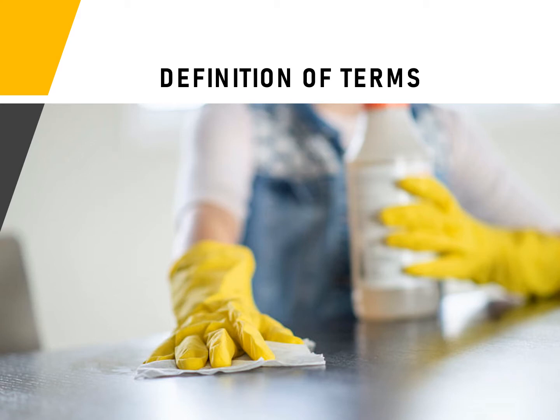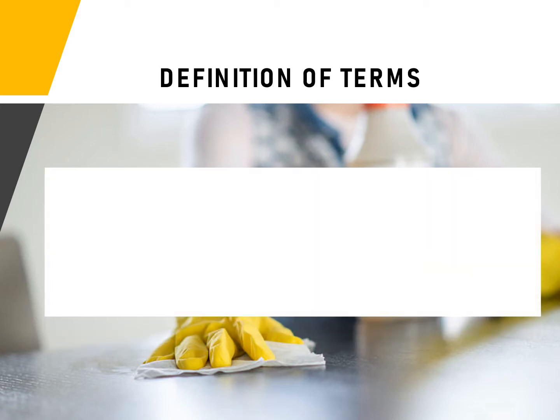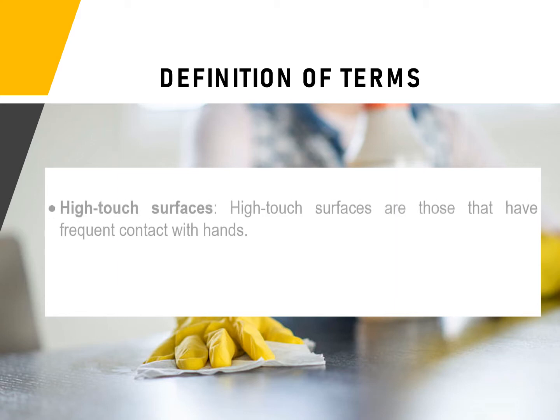We start first by defining high-touch surfaces, which are surfaces that are commonly touched by persons or individuals, or those that have frequent contact with an individual's hands.